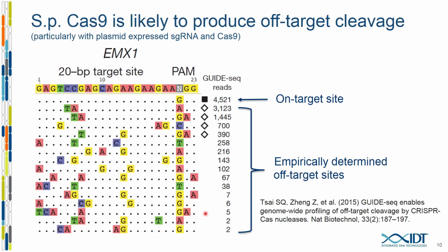So we like this system. It's very, very easy to do. You escape the immune system. You don't have as much toxicity, but there's also another reason we like it. And this all hovers around the idea that the delivery mechanism matters, and most prominently for the reduction of off-target effects. So Cas9 from Pyogenes is known to produce these off-target effects.